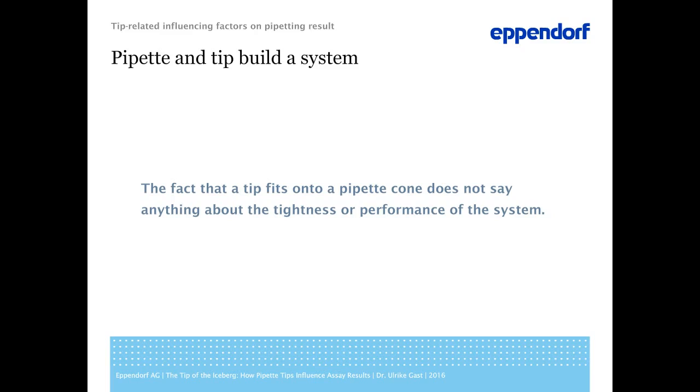Please keep in mind, the fact that a tip fits onto a pipette cone does not say anything about the tightness or the performance of the system. Compare with a coffee machine. The best coffee machine does not deliver best coffee if you choose poor coffee pads.